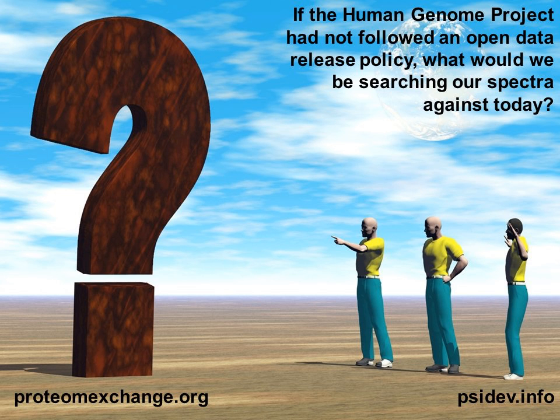Okay, Anu, how granular is the search? Does the search return data sets, or can one search for specific proteins and peptides? So the search is only based on metadata, so you can only find the relevant data sets. And as I mentioned, for some of them, the data on which proteins and peptides have been identified and quantified is not even available because it's in formats which are not parsable. Even for those which are parsable, this is not part of ProteomeXchange.